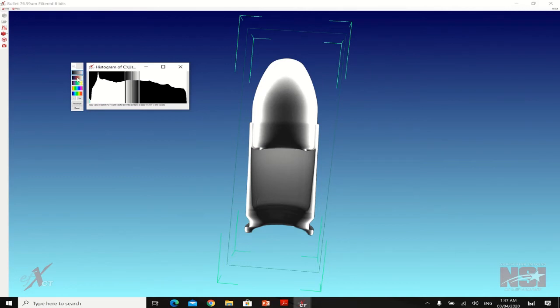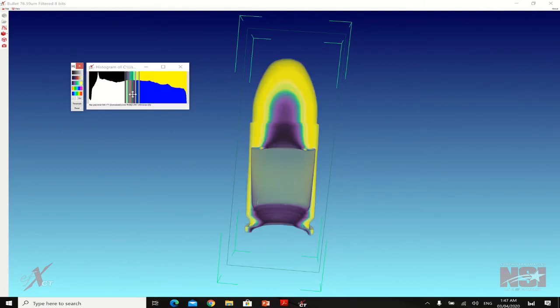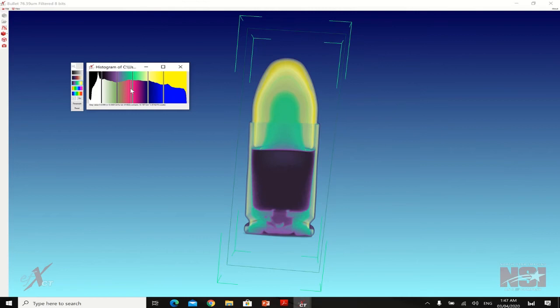For example, this represents gradients that represent densities and gray values. Okay, so you can click this one, changes, and this one. Actually, in different densities, you can also change the opacity. For example, if you choose one of these keys, you will have this kind of cursor, and then you have this small key which can only be changed vertically. So when you change it, it will change the opacity of your color.